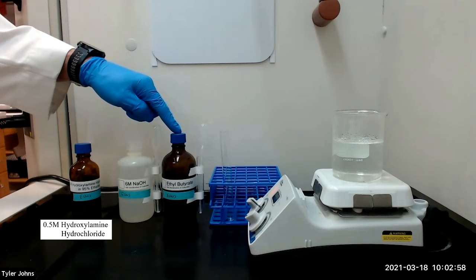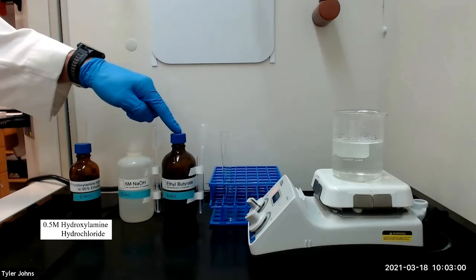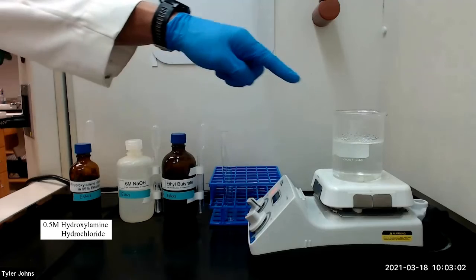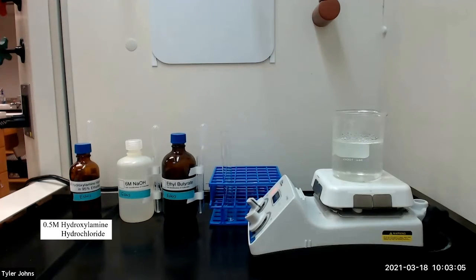We will then dissolve six drops of the ethyl butyrate in the mixture and heat the mixture in a hot water bath until it boils for a few minutes.